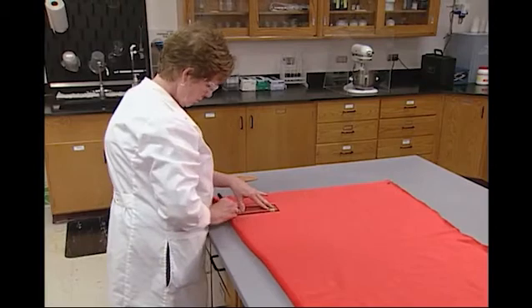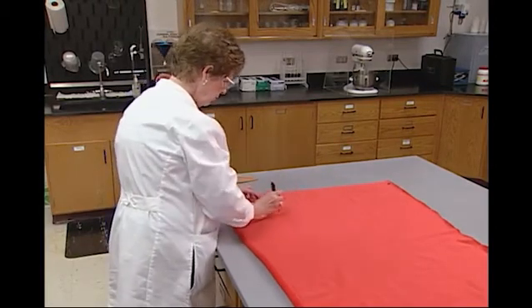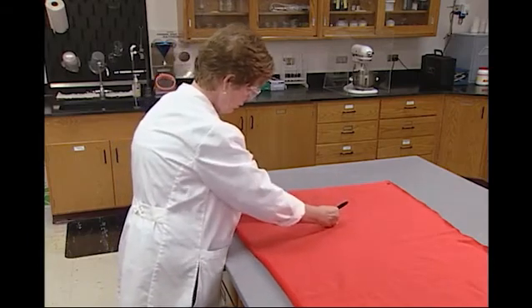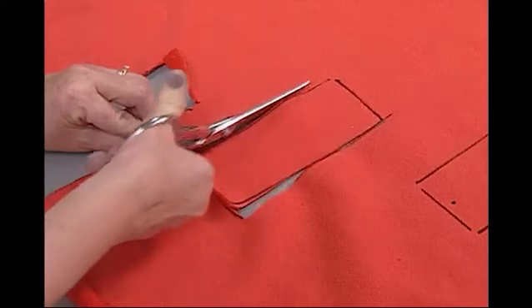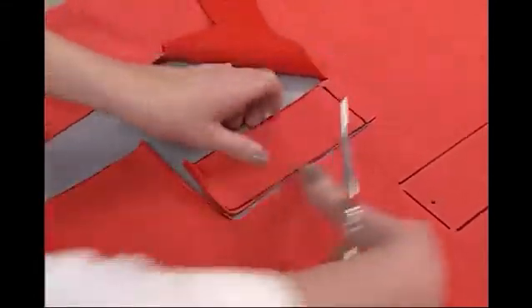Before any flammability testing is performed, preliminary tests are done to determine which fabric direction — length or width — burns at the fastest rate. Therefore, one 50 by 150 millimeter specimen, with the long specimen dimension running in each fabric direction, is cut out.